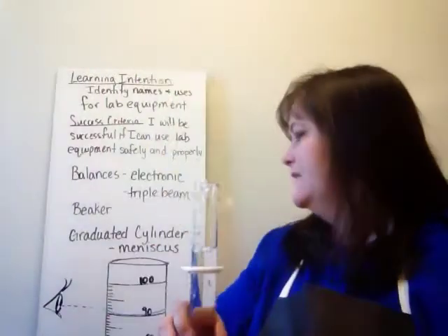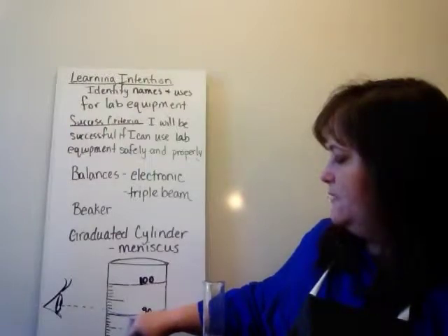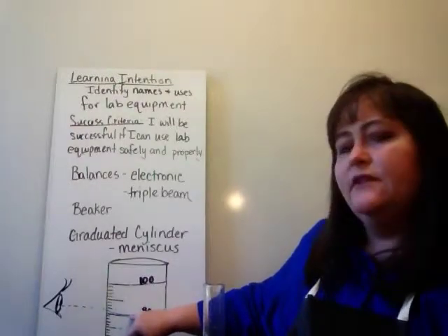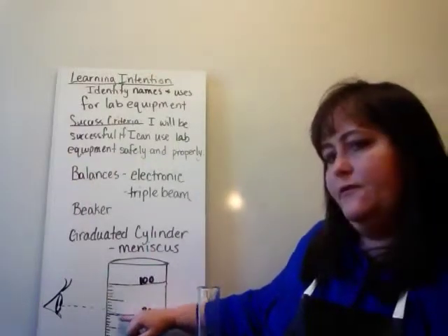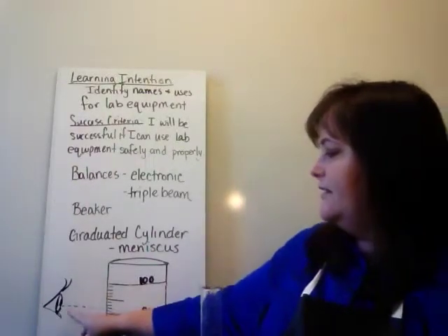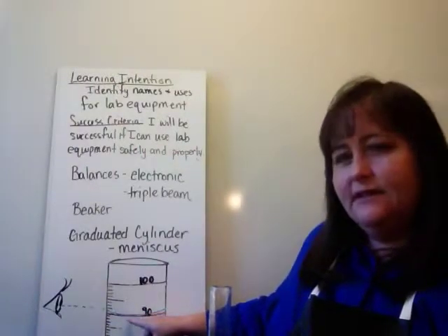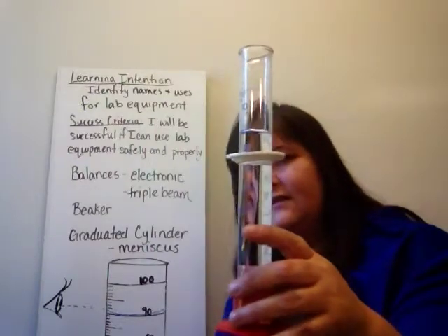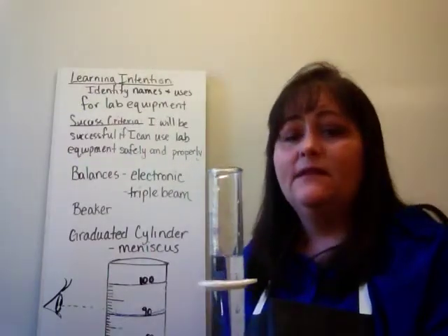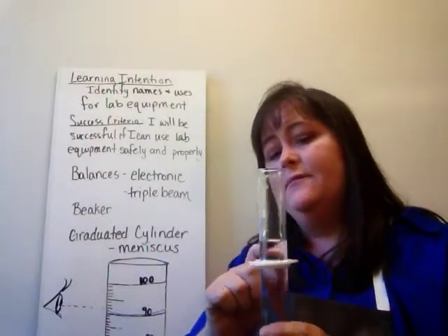Well, that's what we're seeing. Right there is where you measure the volume of a liquid in the graduated cylinder, the bottom of the curve. So you've got to get your eye down on the level with the curve so that you can see exactly how much it is. If you don't, you might think it's the wrong volume. Now, I measured this and I found it to be 90 milliliters because the bottom of the curve is exactly on the 90 milliliter line.